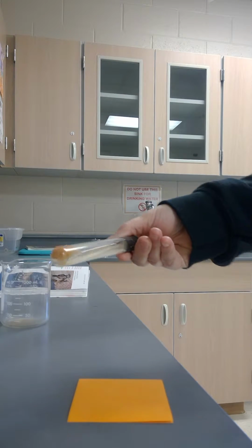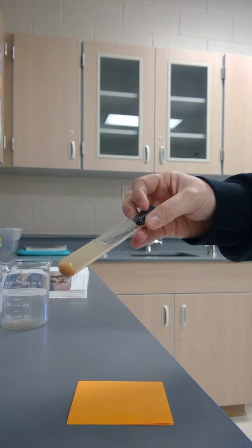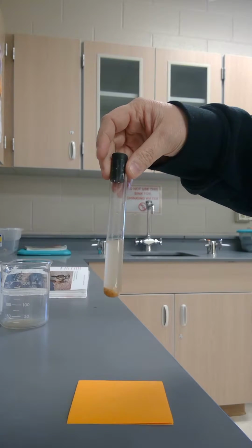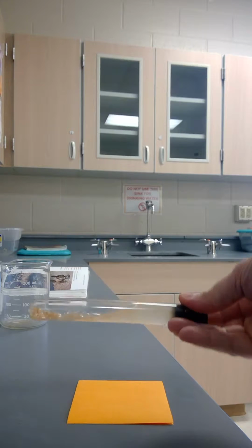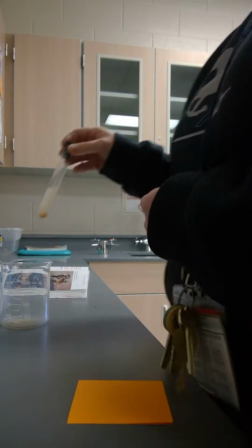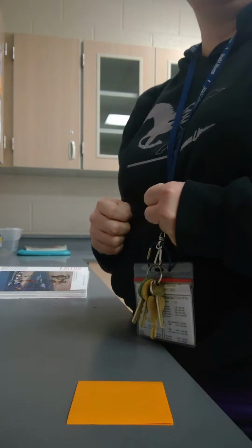So again, what are its observational properties? What do you notice? Do they mix well? Do they not mix well? And then go ahead and document those down. I would anticipate that you would have probably 2, 3, maybe even 4 observational properties for each of those.